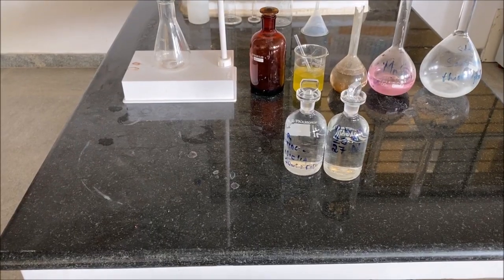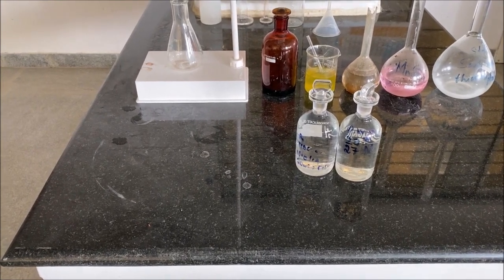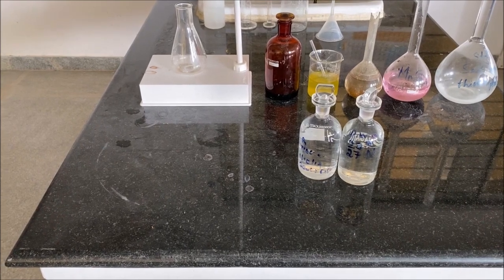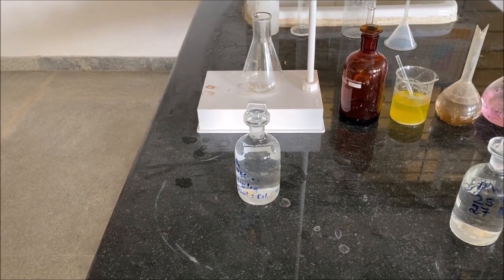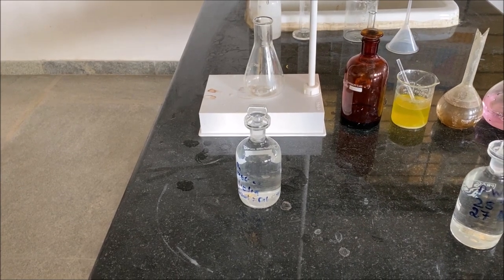The 2 BOD bottles, which were kept in the thermal chamber at a temperature of 20 degrees Celsius, are removed after 5 days, and now they are ready for titration. Now, one of the BOD bottles is considered for titration against standard sodium thiosulfate solution.